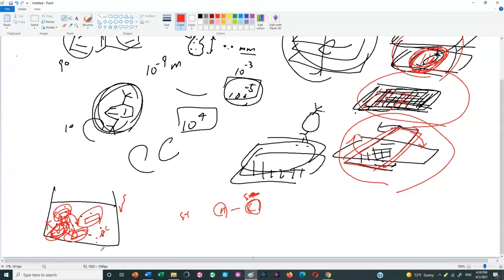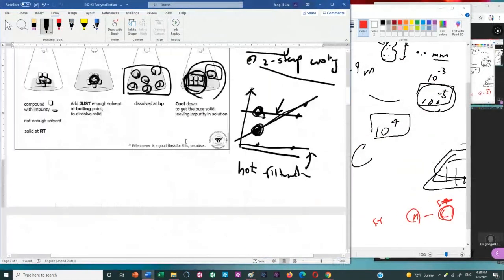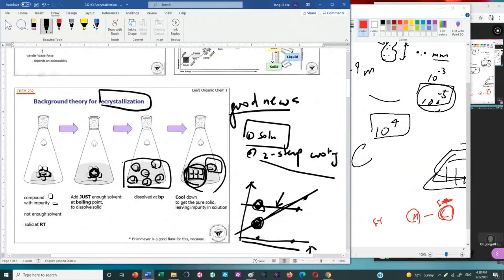until the other piece of paper, the naphthalene molecule, comes down and finds the best fit, and then they stack up nicely when you do it slowly and take away their motion, their freedom. Okay? So this is the second reason for successful purification.